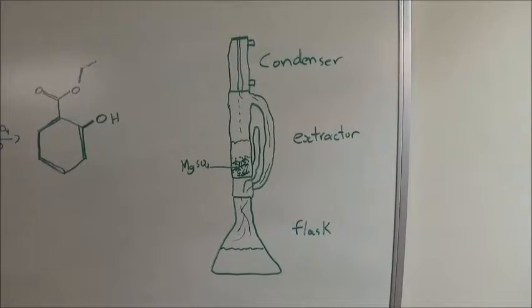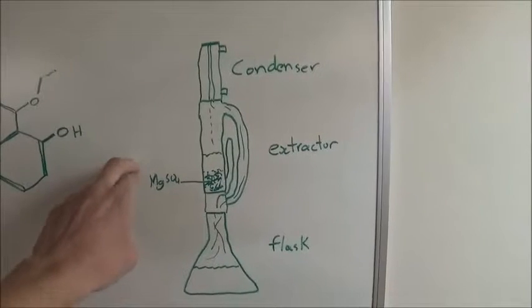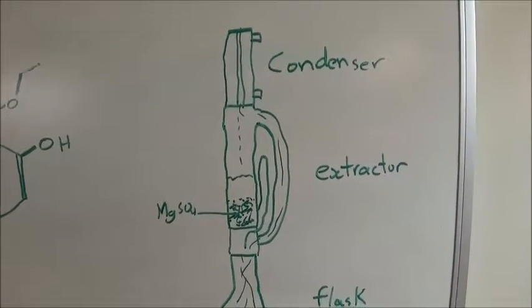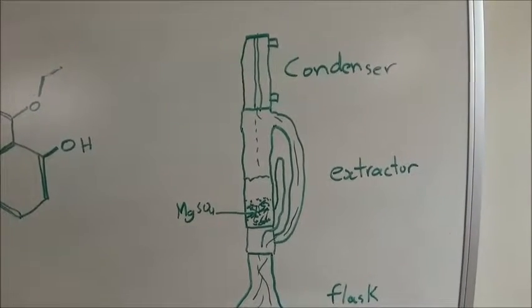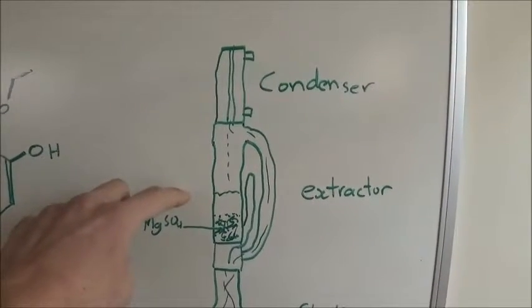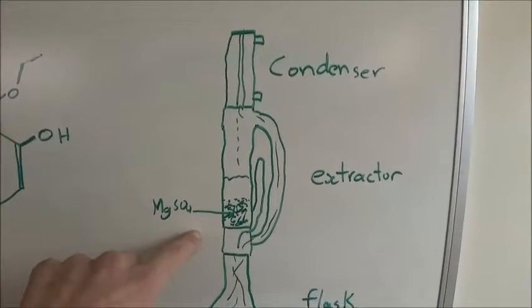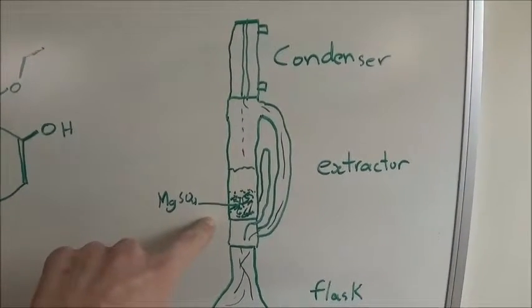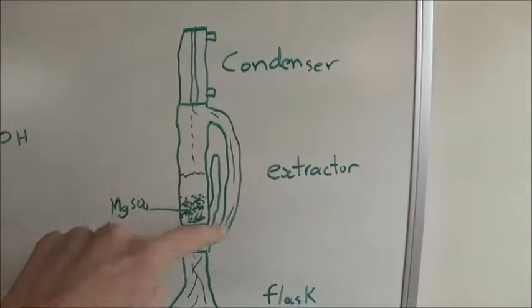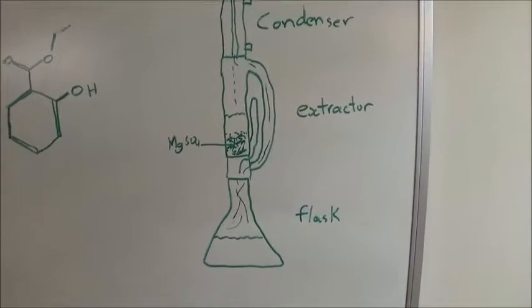I'm going to try a different way to remove most of the water. Over the reaction flask I'm going to set up a Soxhlet extractor and a condenser. The Soxhlet extractor will fill up with ethanol and water as it condenses, filling up the chamber. In the chamber I'll have some anhydrous magnesium sulfate, which will remove the water by becoming hydrated. When the level of ethanol rises high enough, it will be siphoned out and go back into the flask — this way the water will be removed.